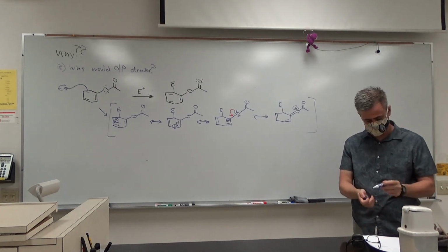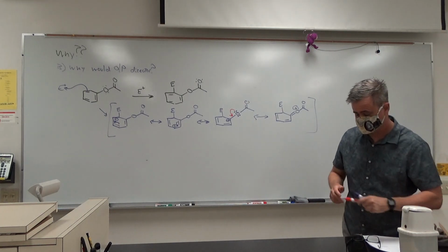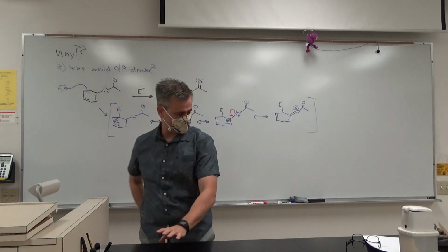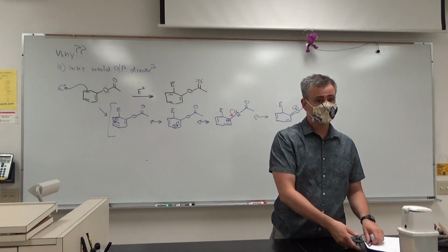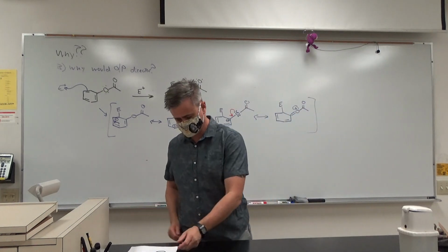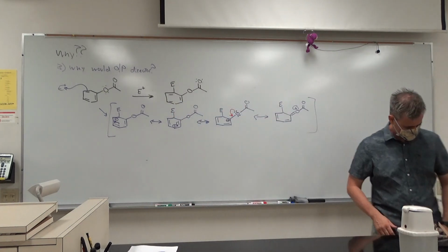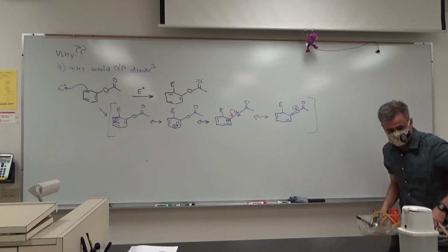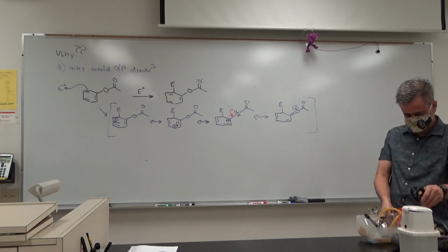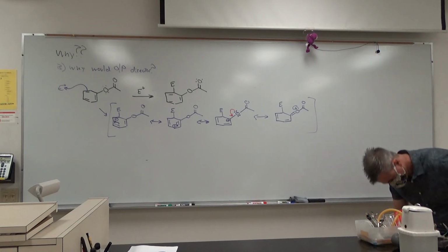Okay, that's it, guys. Let me talk just a tiny bit about the setup and everything. We're pretty much doing it until the recrystallization. We're doing it pretty much like it is straight out of the book. But we are going to flame dry the key pieces.